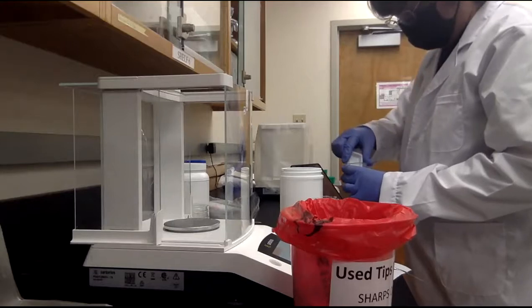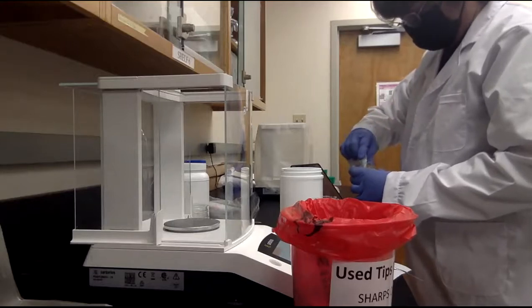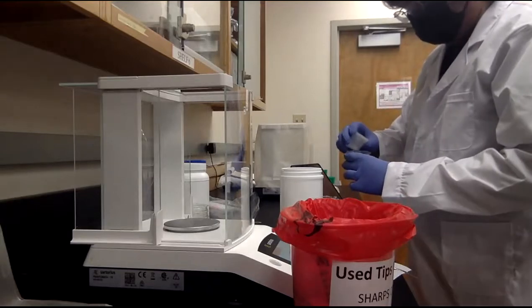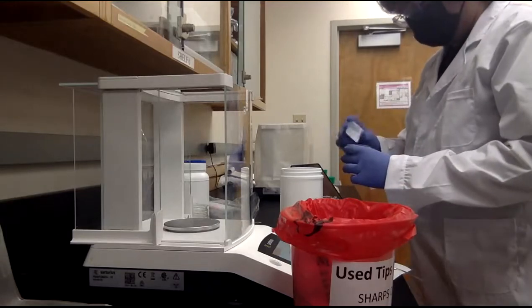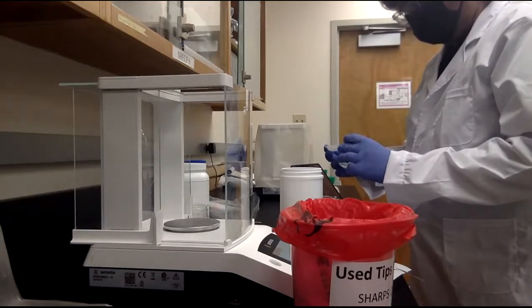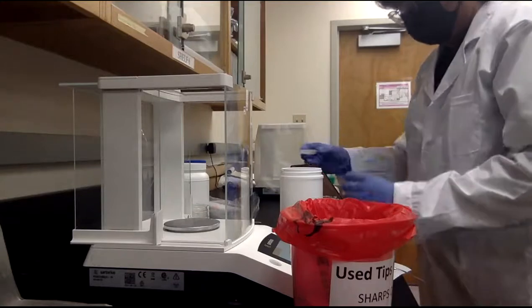Yeah, you'd better label it, or as long as you can remember what it is. Is it like an OSHA regulation to label all your beakers and stuff? Oh, I don't have a marker for this. That's fair. Don't worry, I won't report you to OSHA. It's fine.